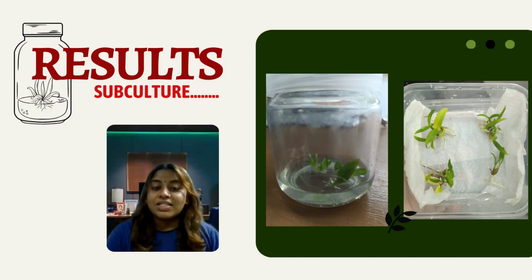As we can see, this is the result of the subcultured plant. In the first picture, we can see that the plantlets were subcultured into the agar medium in the jar. The second picture is the plant that grew in the jar for 2 weeks. So we transferred the plantlets to a sterile box. This is the first stage of the acclimatization phase. So we can see there is a bit of root development and also leaf development.